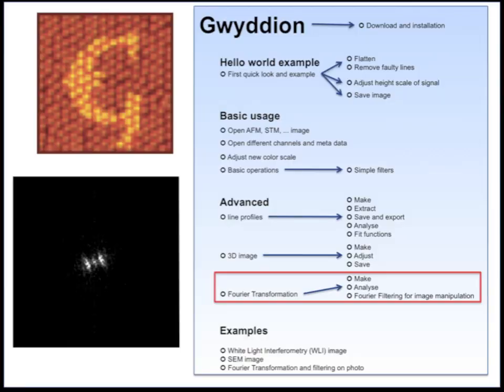To sum up, we learned how to show the Fourier transformation of an image, how to use Fourier filtering to separate different signals in an image, and how to separate the signals with long range from the data with short range, for example.